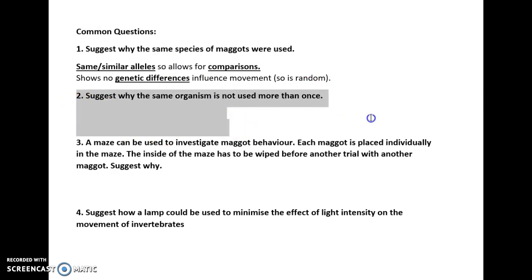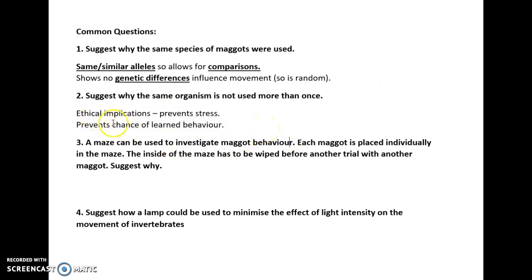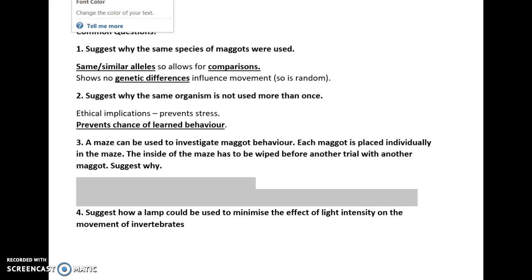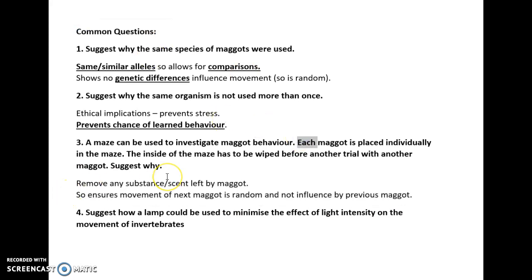Another question is: why is the same organism not used more than once in the choice chamber or maze? There are two reasons. First, it prevents any stress — an ethical consideration when using organisms. Second, and more importantly, it prevents the chance of any learned behaviour the organism might display once inside the chamber. Also, the inside of the maze must be wiped before another trial, to remove any substance or scent left by the previous maggot.